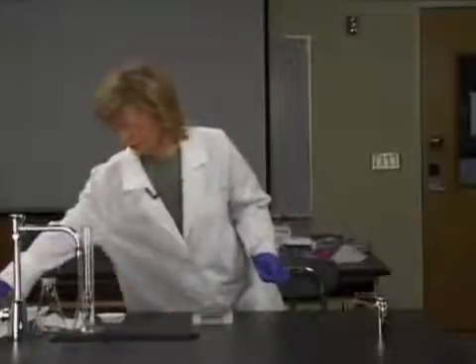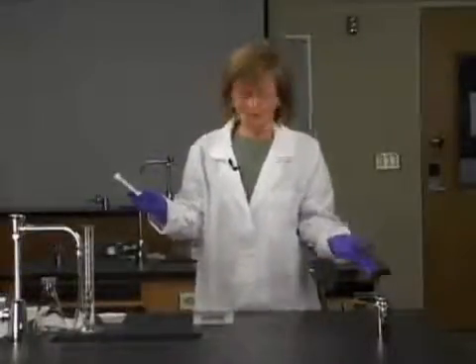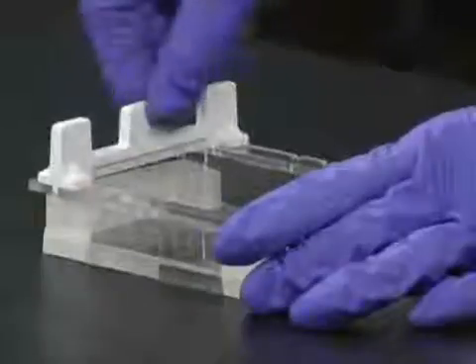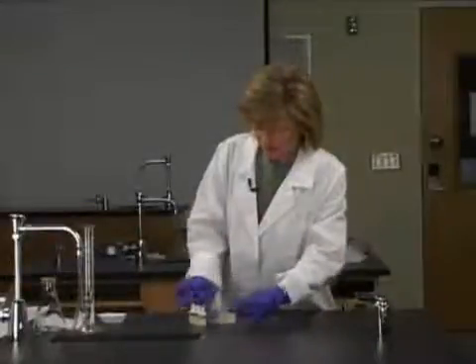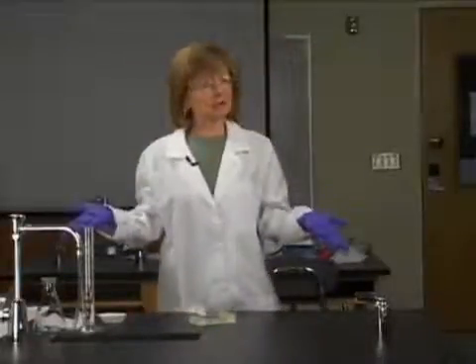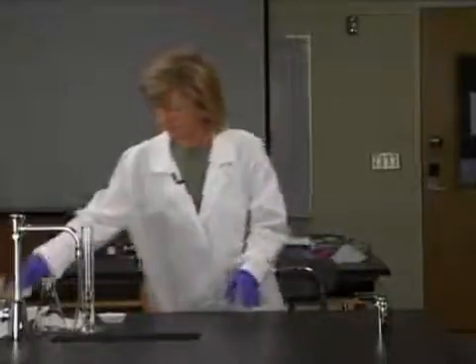Now, a lot of people put their comb in after they pour their gel, but frankly, I've never seen any difference. I've never seen, for me, any bubbling around the teeth of this comb. So I just usually put the comb in immediately. Now, we're going to make the regular agarose gel. So I'm just going to move this out of the way for a minute.